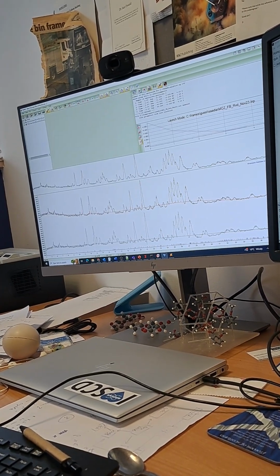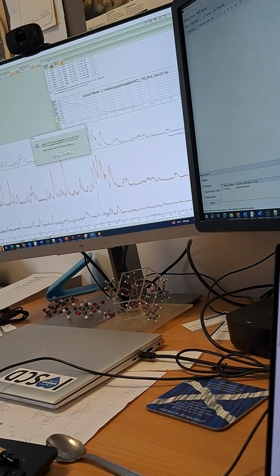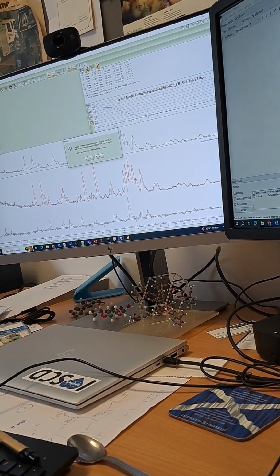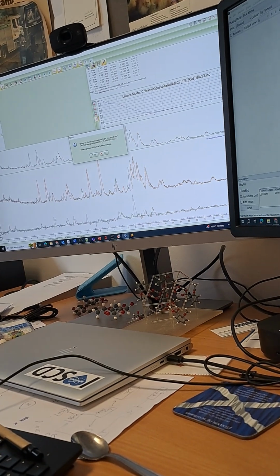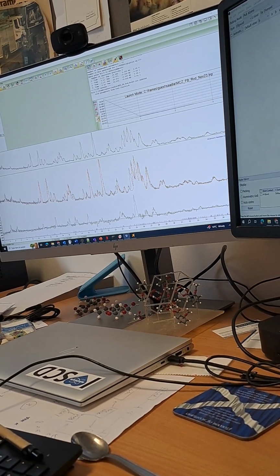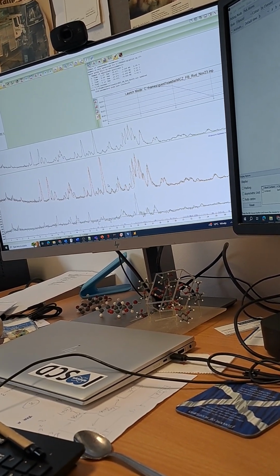We're opening up that thing there. You can see that by having that ability, it's gone and sucked in. Now the question is, have you got the right peaks everywhere? There's a peak over here, you're fitting that one reasonably well. There's a peak here that's fit really well. These two seem to be fitting okay. This one's missed out. This one's a 3. So you're right, you have got a mixed phase of this material. You've got the free base by itself, but you've also got something else in here too. Now the question is, what is that something else?